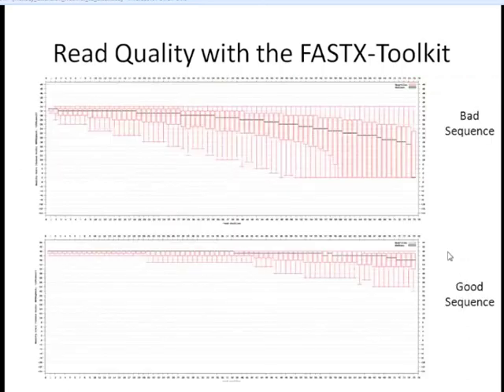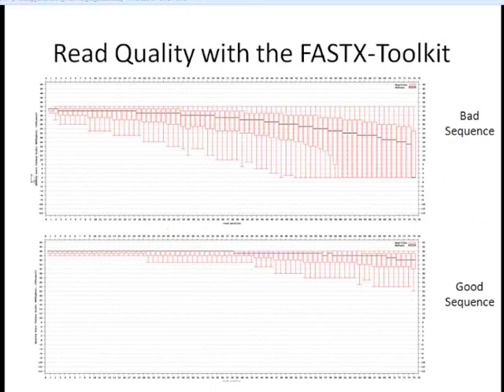These two commands give us a box plot representing all reads within that library. Along one axis is each position of the read — these were 75 base pair reads. On the other axis are the Phred-like scores. This shows the distribution of quality scores at each base position across all reads. Ideally we'd like everything above a Phred score of 20. You can see one example where quality deteriorates very quickly — those are poor reads. But something more like the bottom scenario, where quality stays high, means those are good reads.